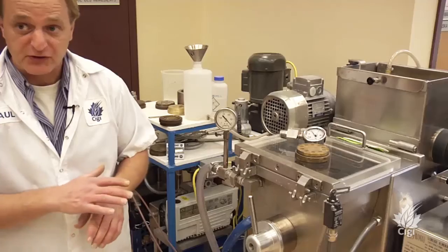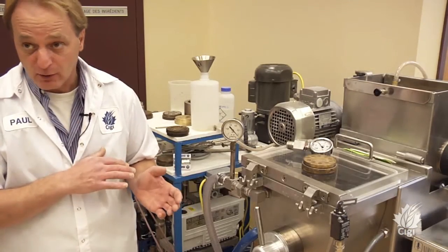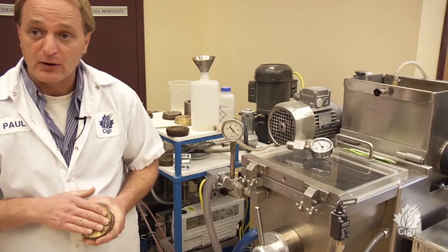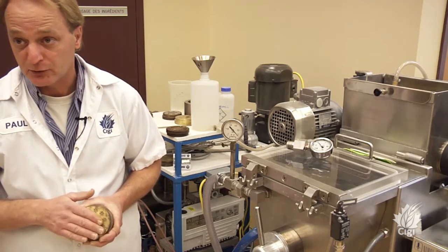Here we focus on Canadian Western Amber Durum. The minimum quantity we need is about three kilograms of durum semolina extracted from the durum wheat. This is our lab-scale pasta extruder. We adjust the amount of water going into the dough because typically in a pasta factory, they extrude the dough through a die, with pressure at the die running about 1,400 pounds per square inch.